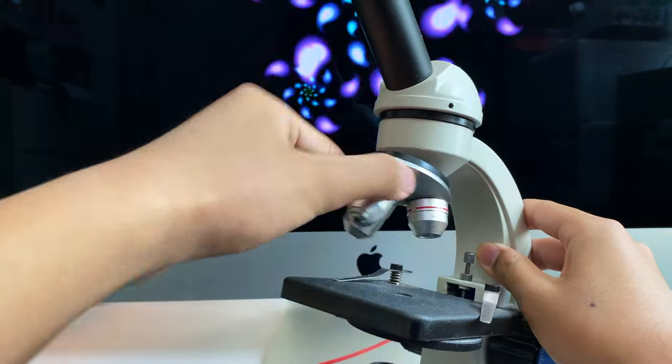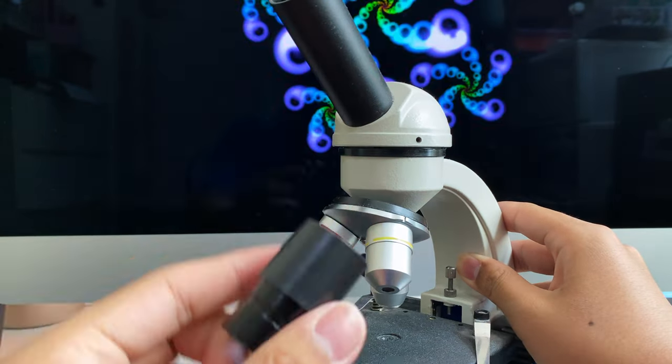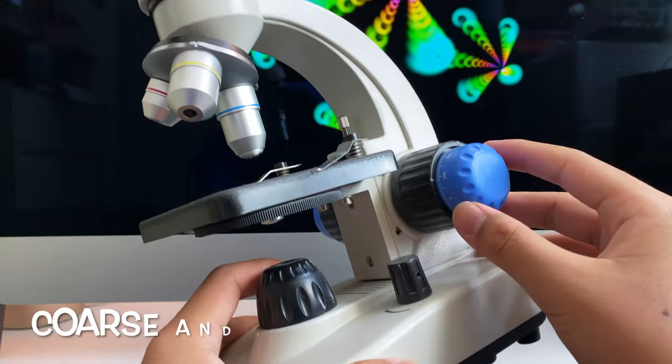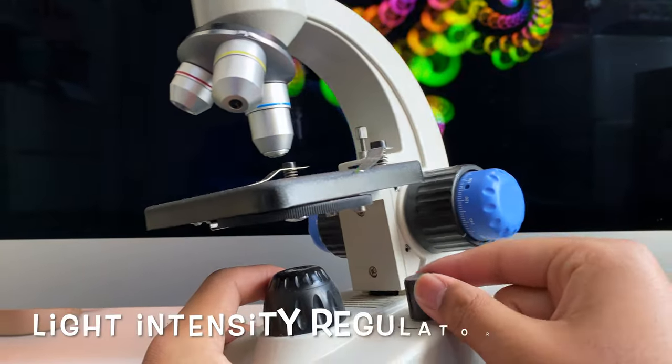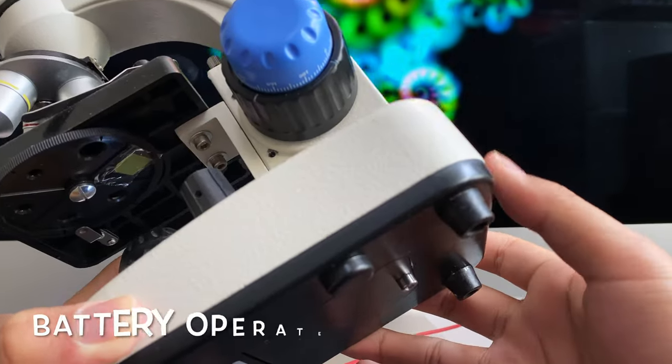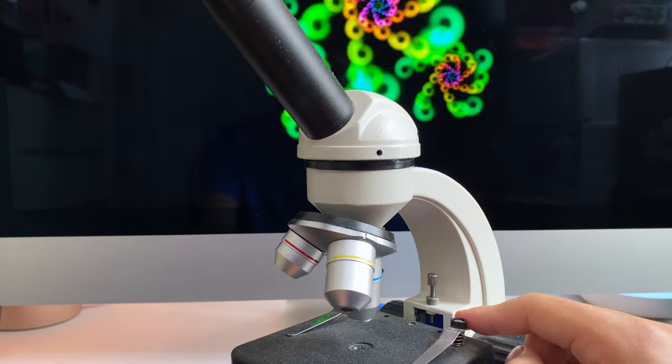The Swift SS110 has three objectives: 4X, 10X, and 40X. It has one eyepiece, a coarse and a fine focus knob, and a light intensity regulator. It's also cordless, so you can operate it on battery.